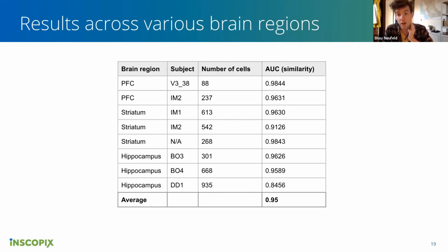There are a couple here and there, but I think overall these differences are driven by cleaner spatial footprints that we're getting, which might have to do, we haven't tested this rigorously, with this improved way of merging patches.